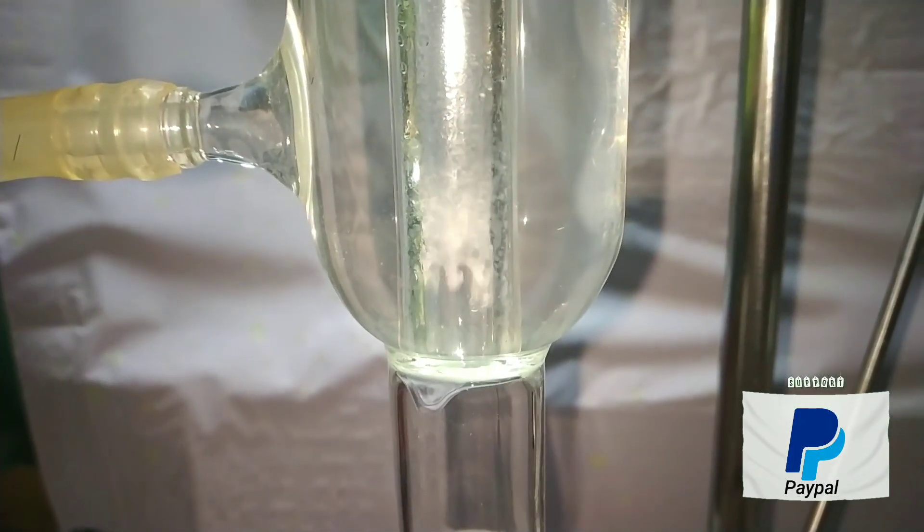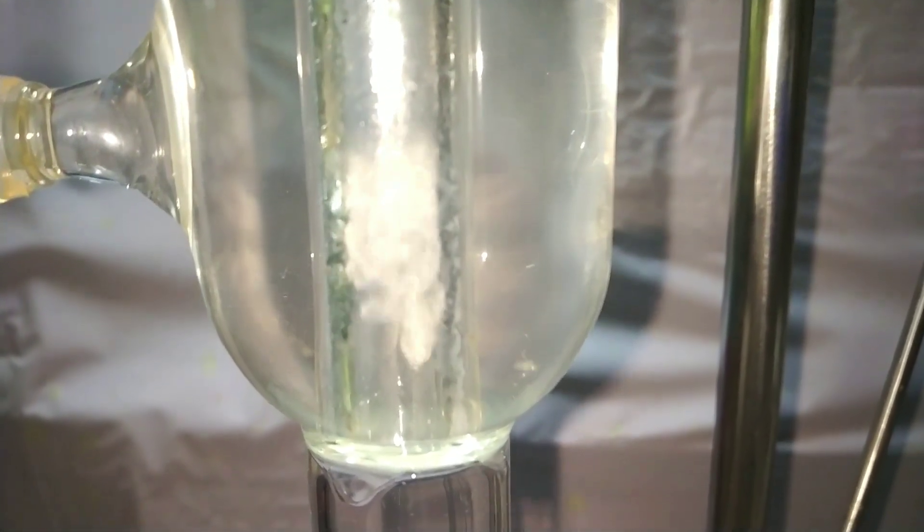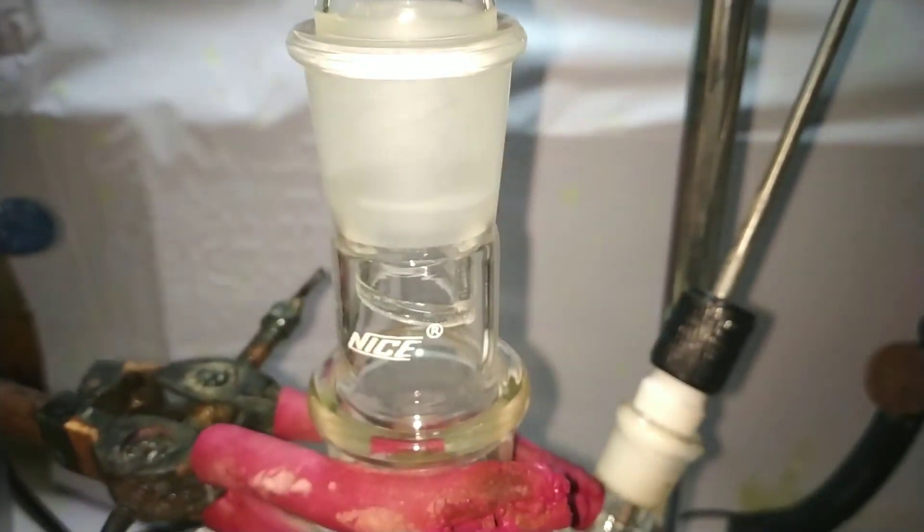I captured this clip because I found it interesting — this is the point where the vapor front of toluene condenses in the condenser back to the liquid state.